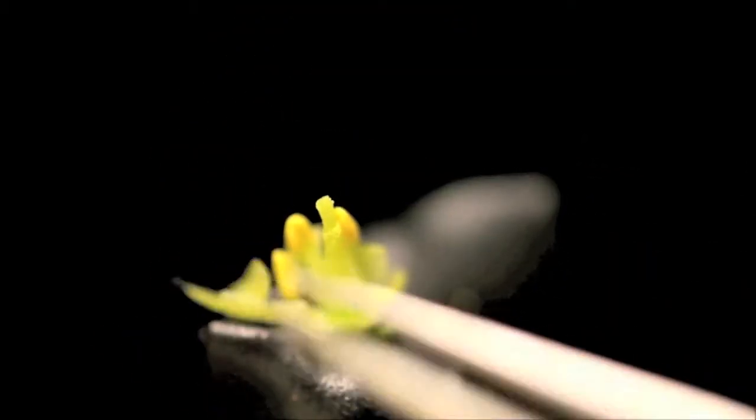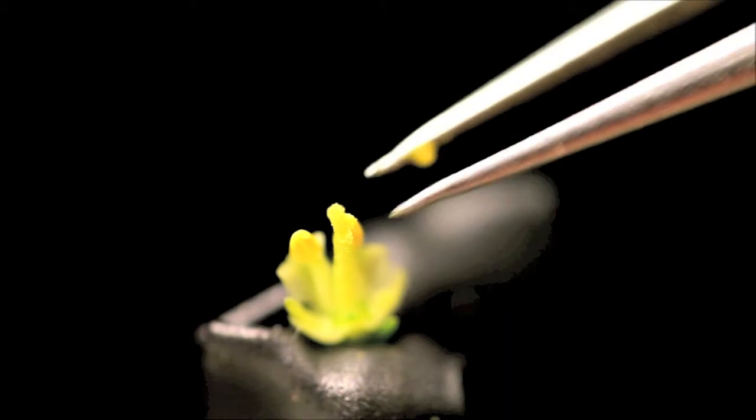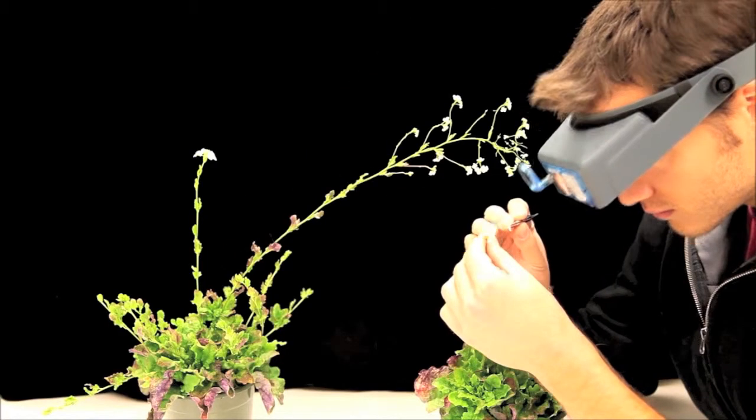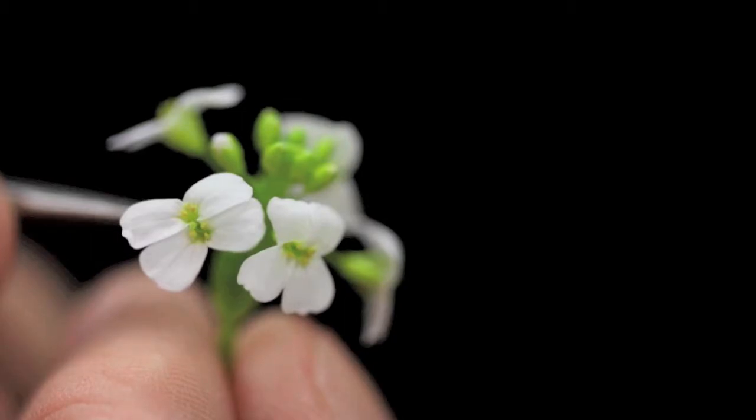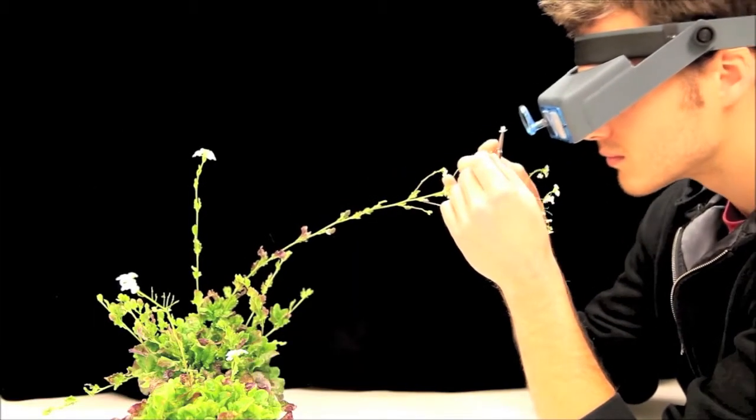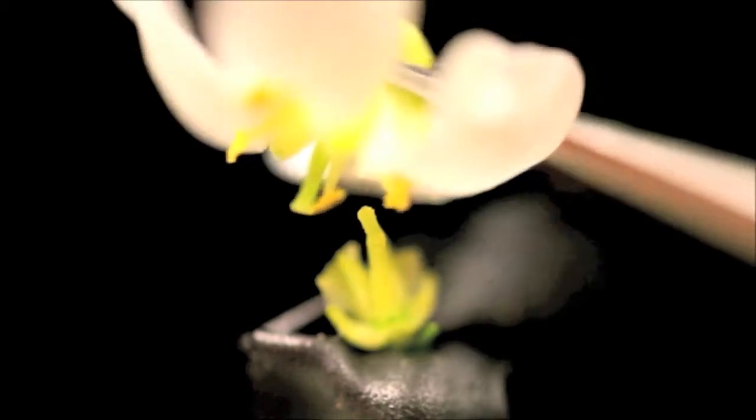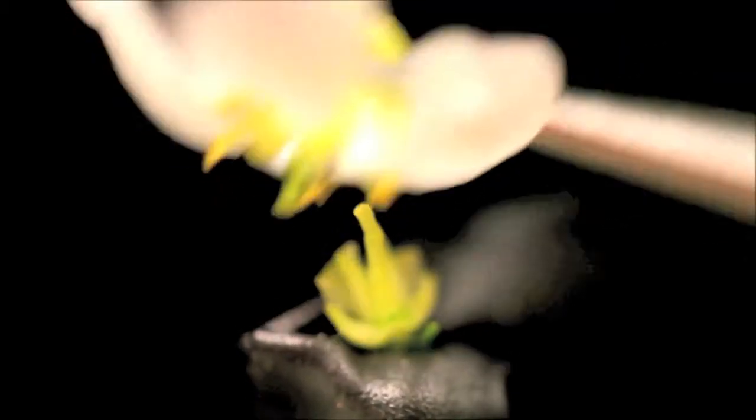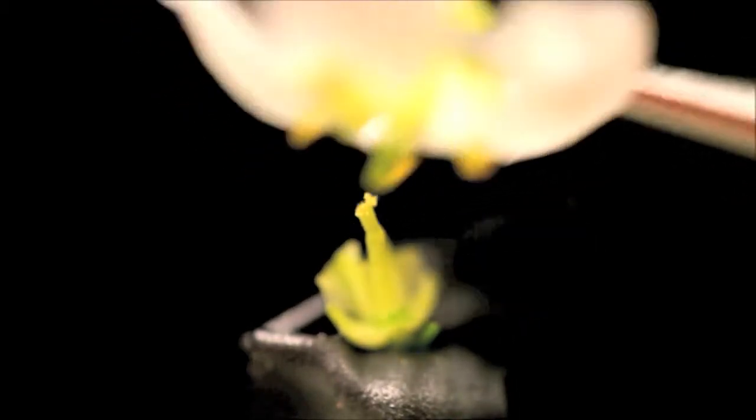Make sure to keep track of this flower as it will be the female in the cross you're about to perform. Next, grab a flower from the GL1 mutant plant with your tweezers and try to pollinate your female flower by touching the stamen to the pistil that you are holding. Again, go slowly and be careful. You do not want to damage the flowers.